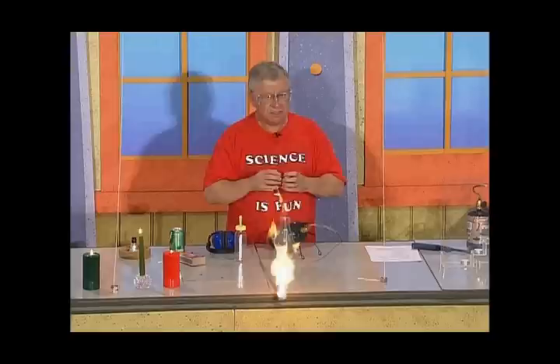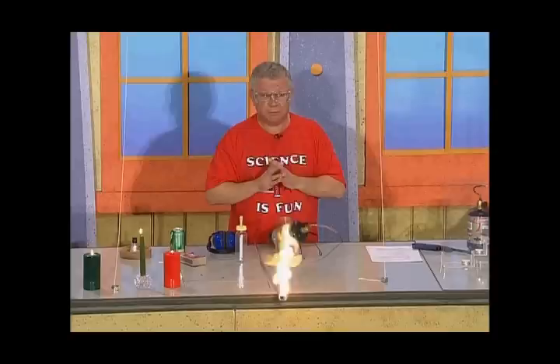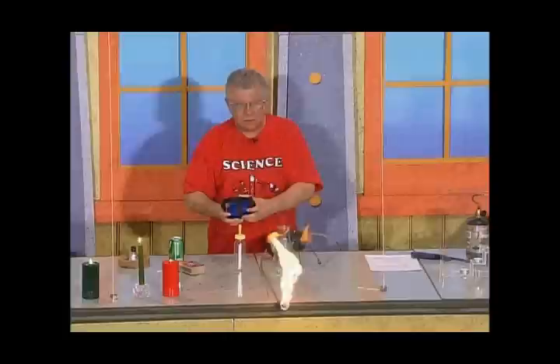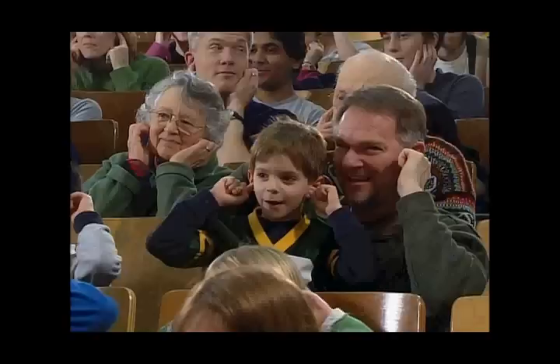Some gases burn and some other gases do not burn. We're going to find out what's in those balloons now, because I'm going to take this flame and try to touch one of the balloons. But we always obey the safety rules. I can't put my fingers in my ears and do the experiment at the same time, so I'll do this. But I want you to protect your ears very, very well. I can't hear your reaction, but I can see some of you smiling. That means you don't have your ears well protected. Please protect your ears as we go to this first experiment right here.